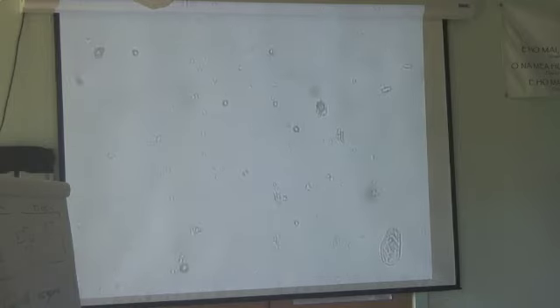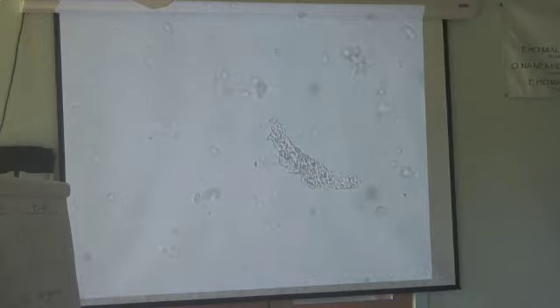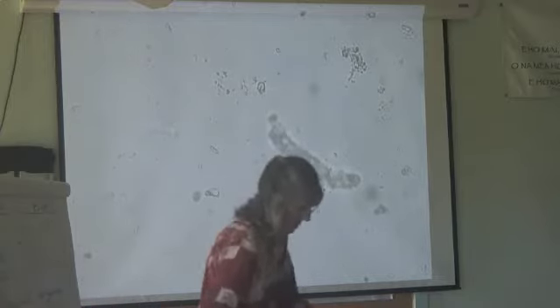What is that coil thing there? That was a scratch on the plastic of our cover slip. So I'm exiting that cover slip, not using it anymore. So actinobacteria, we got lactobacillus, there's a testate amoeba. Those testate amoebae are probably left over from the forest that they tore down to plant this pineapple.